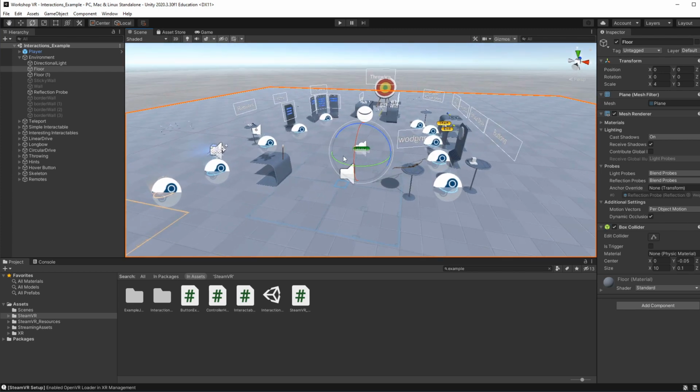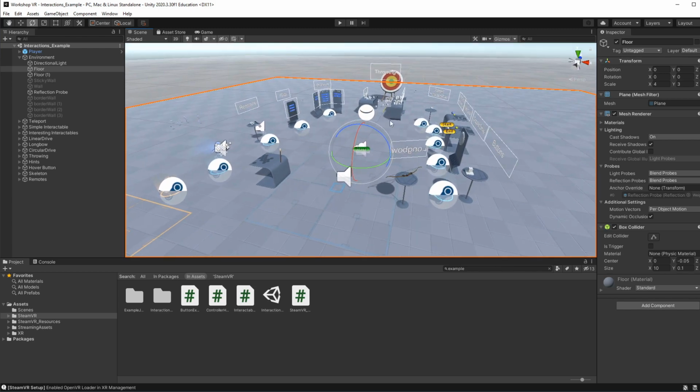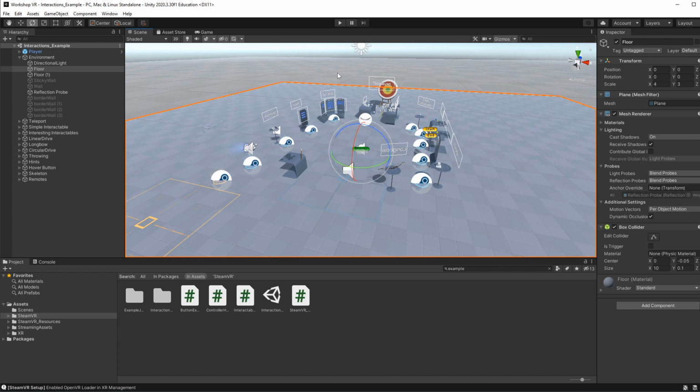And in any case, when I want to build some simple VR application, I sometimes even copy this scene and start from there, just delete the stuff that I don't need and reuse a lot of the scripts, components and game objects that are already here. So for instance, we can already go ahead and play and experience this scene in VR.